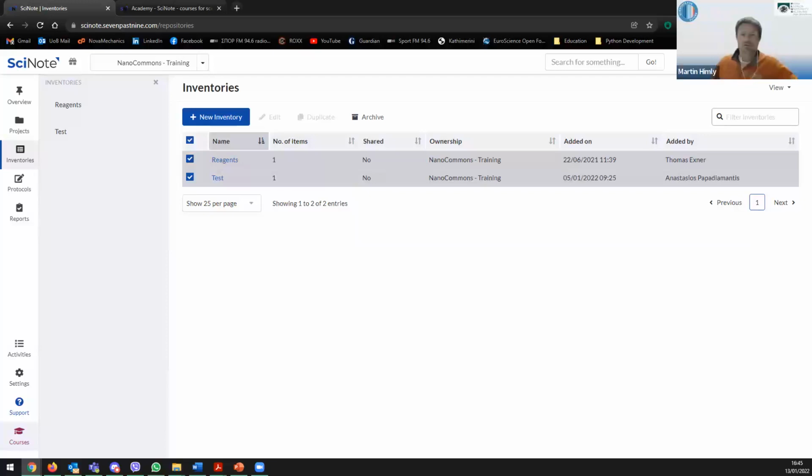If people start playing already and put data in the cloud version, and then after the second workshop decide to get their IT service to install the local version, how easy is it to transfer all that? You can, with export functions, more or less transport things easily.